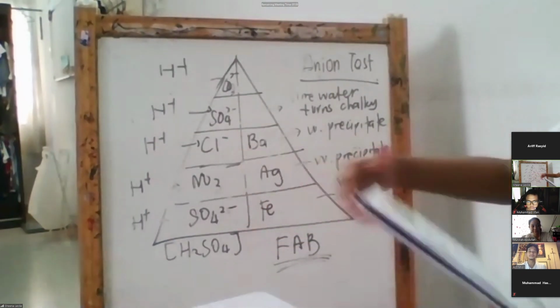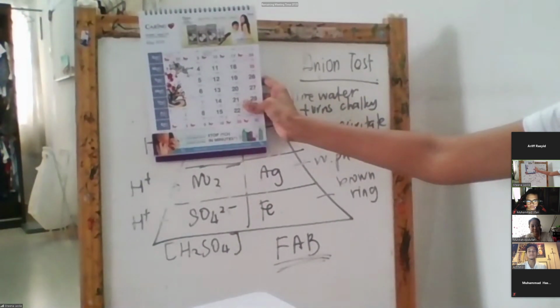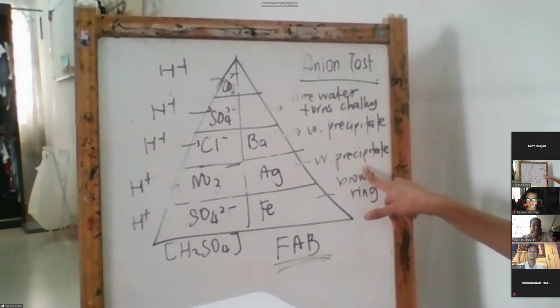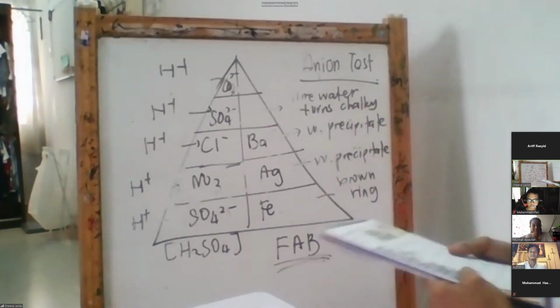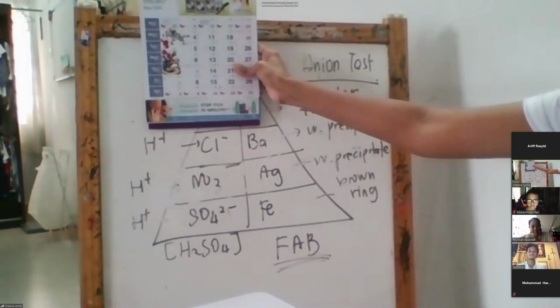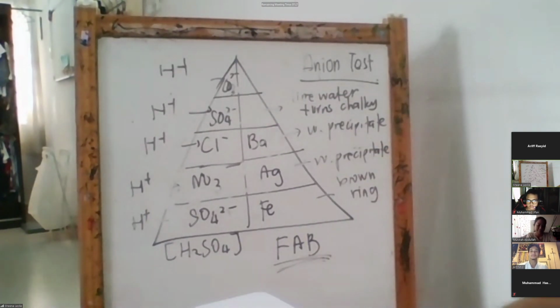Okay, now I want to test for chloride. I close chloride. What do I add? Nitric acid. Very good. And the other thing? Silver nitrate, excellent. And what do I get? A white precipitate, excellent. Okay, I want to test for my sulfate. I close sulfate. What do I add? Hydrochloric acid. Good job. And then after that I add barium chloride. And what do I get? A white precipitate.